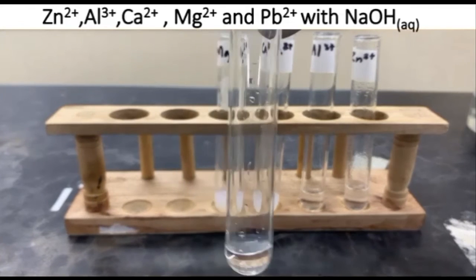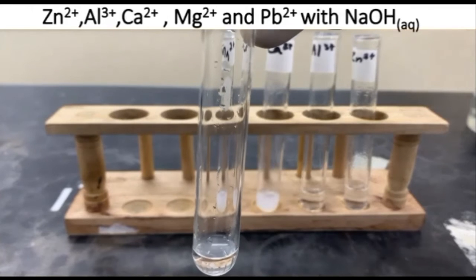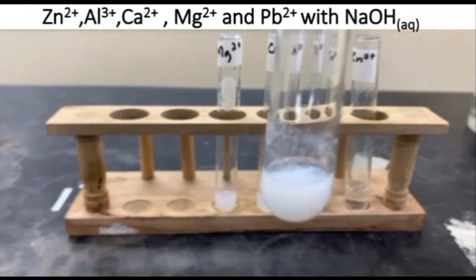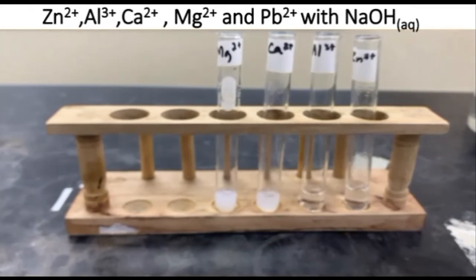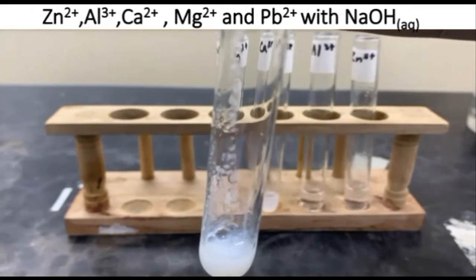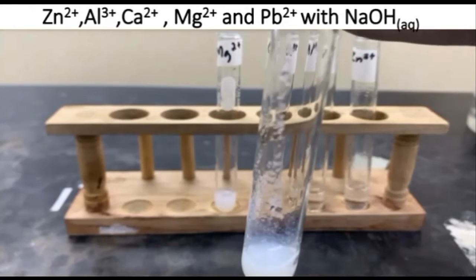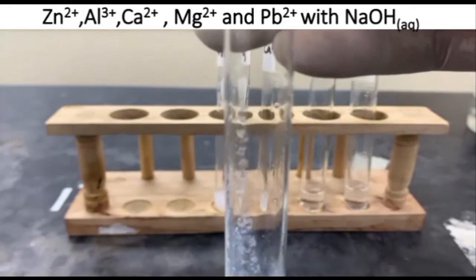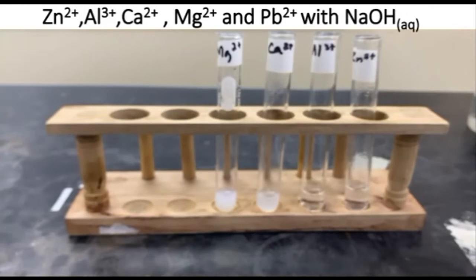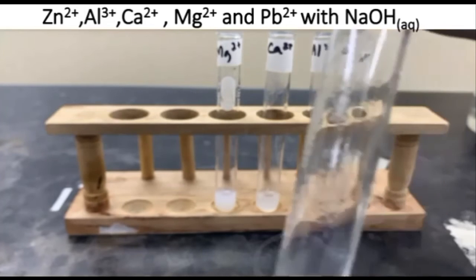So here we go, the fifth one, we're treating lead 2+ ions, and we've gotten a white precipitate. So we'll pour off most of the mixture so we can add our sodium hydroxide in excess. And let's see. We're still going to pour off some more just to ensure that we add the sodium hydroxide in excess.